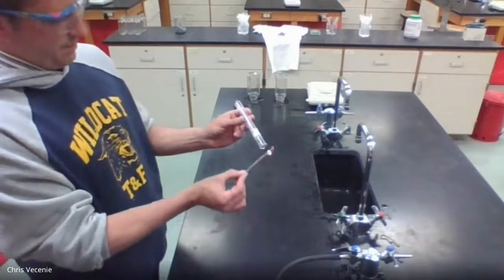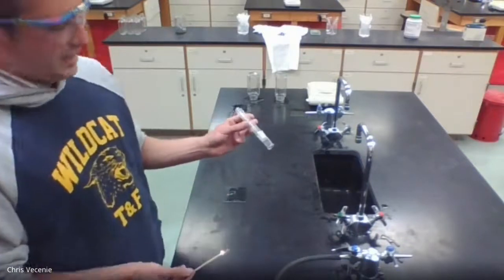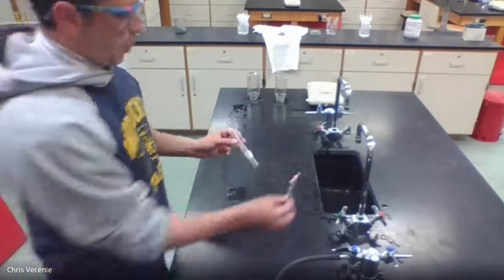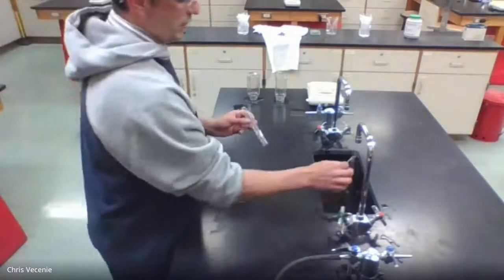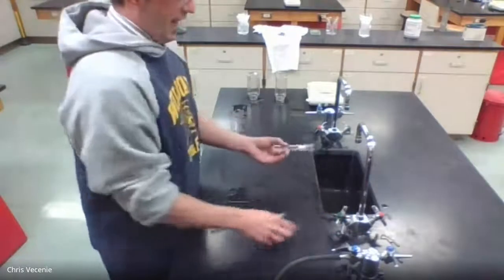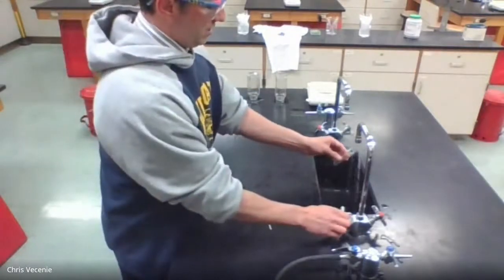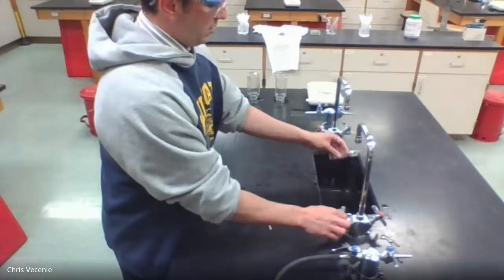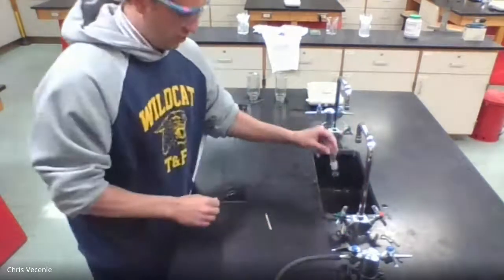Testing it a second time. There it is again. All right. So in fact, we got some barking sound. Two different times we confirmed that the hydrogen flowed from the test tube on two different occasions.